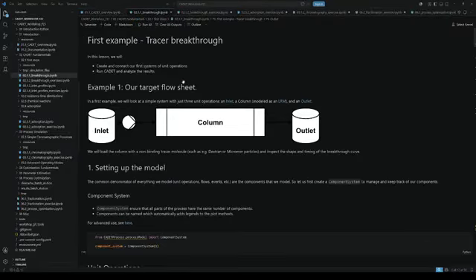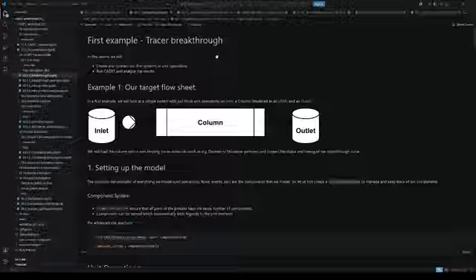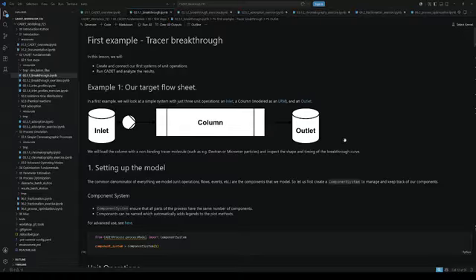All right. I'm going to keep the explanation of how CADET works especially short, but we want to try to implement what we learned in the last two lectures. So for the beginning, we want to start with a simple model of a breakthrough through a chromatography column of one component. And for this in CADET, we're going to try to build this experimental setup.